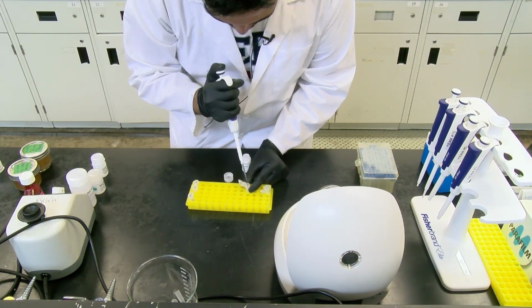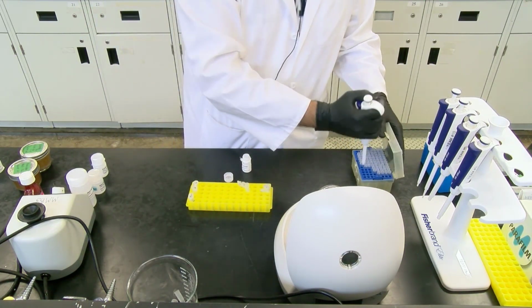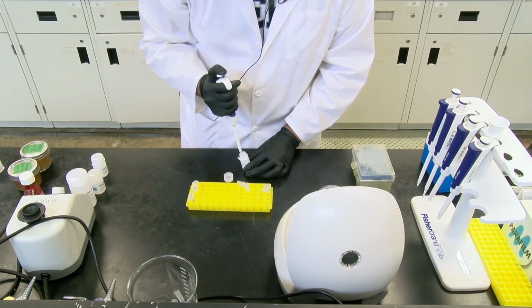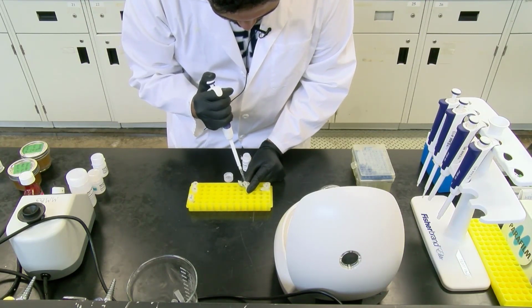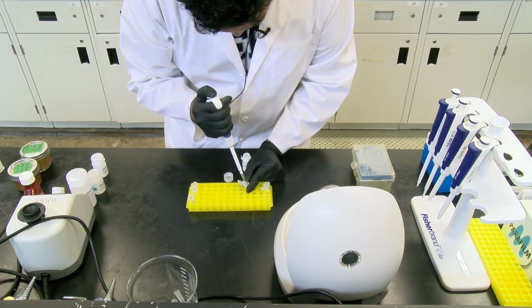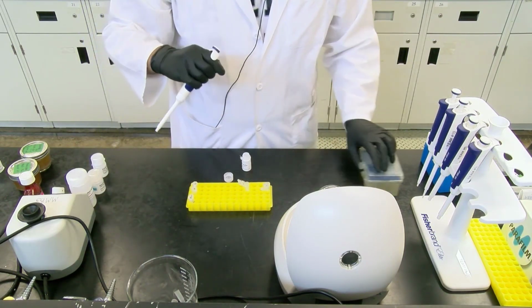So you're going to want to be very careful. If it touches anything else, you want to discard it, because at this stage, anything that does elute through will contaminate the DNA. And we let this incubate for 2 minutes.